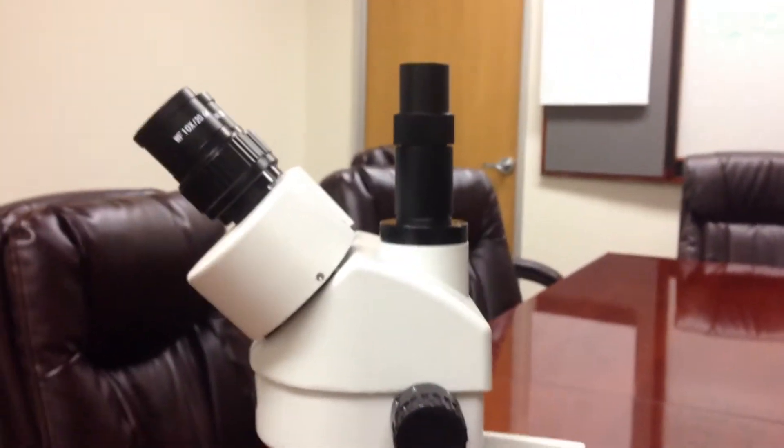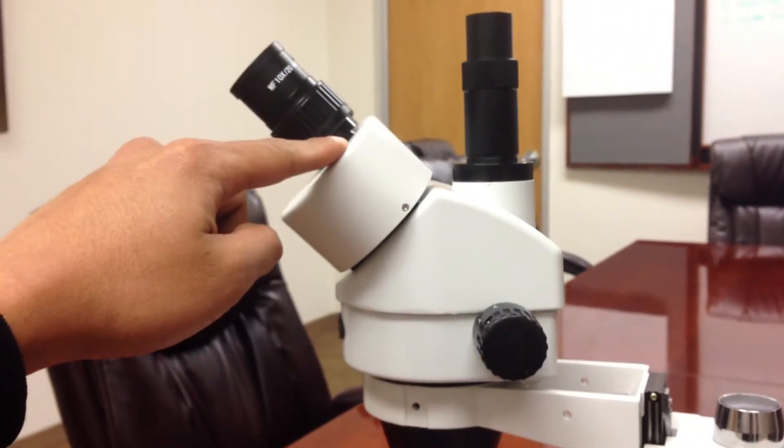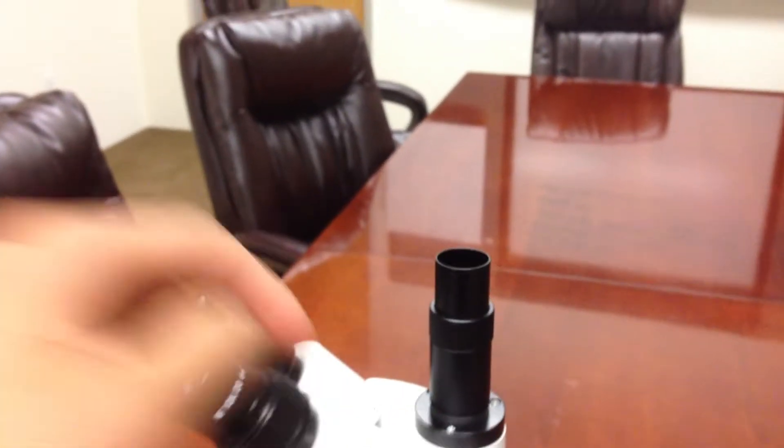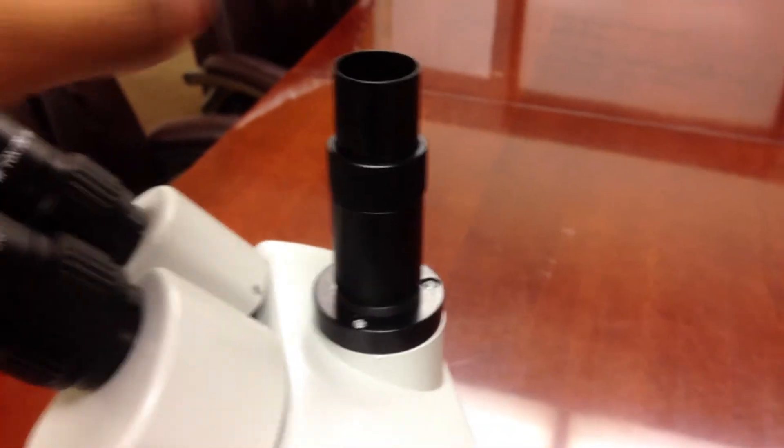So basically, if you're attaching it to an SM microscope like this one, this is a stereo zoom microscope, some of them come with a trinocular head. And trinocular meaning that there's three ports. So you have the two eyepieces and the third port. The third port is the trinocular port.